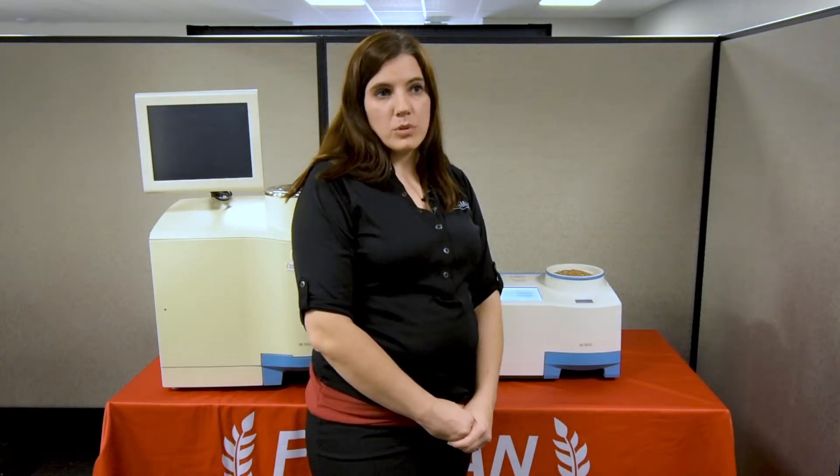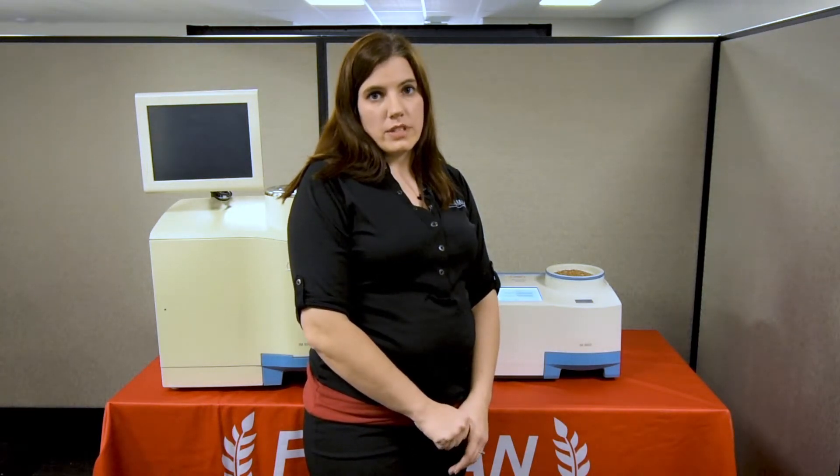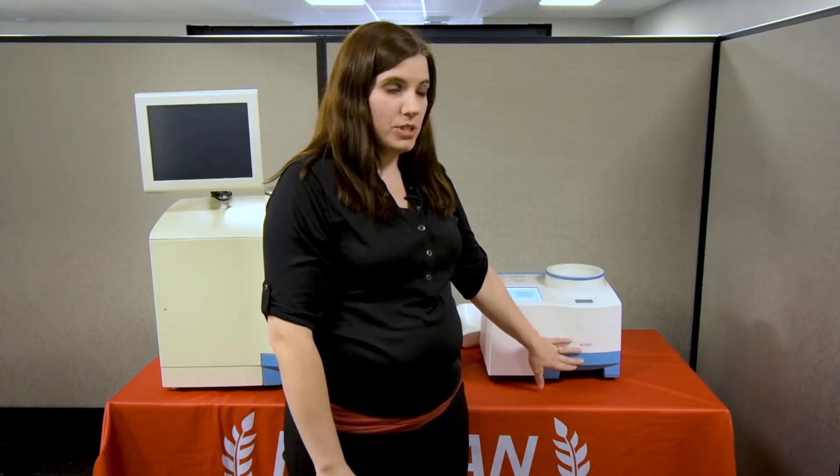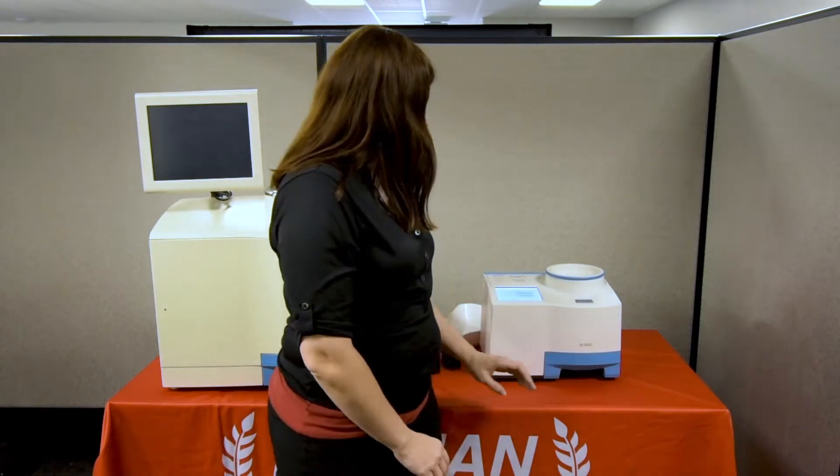One thing to note: both of these machines use whole grain, so there's no need to grind the sample, waste time doing that, or get rid of the sample at the end. Any excess grain will flow through the machine and all of the sample will come out the bottom.